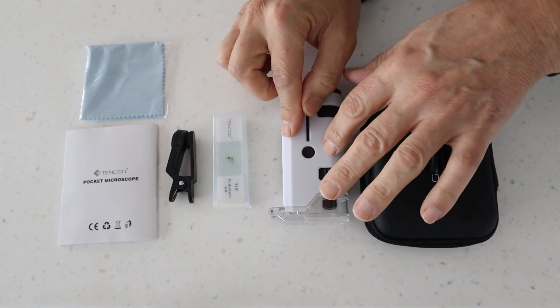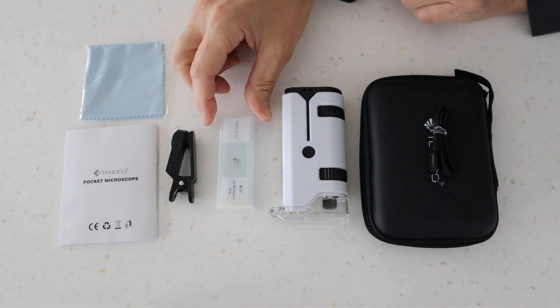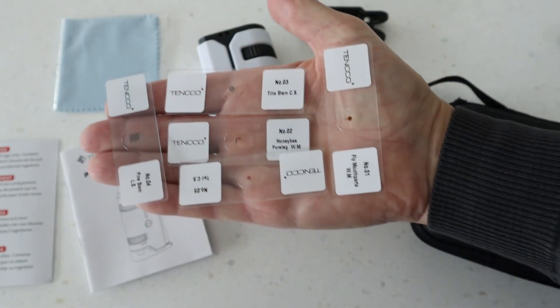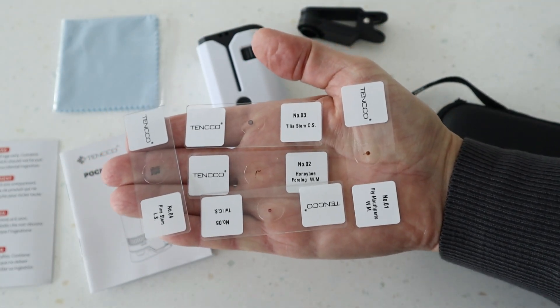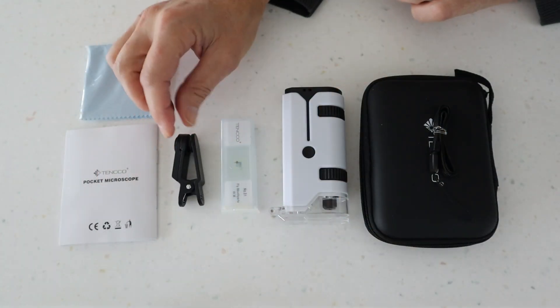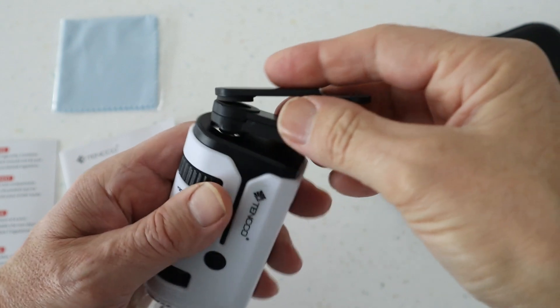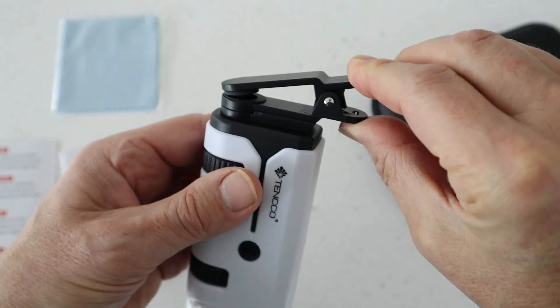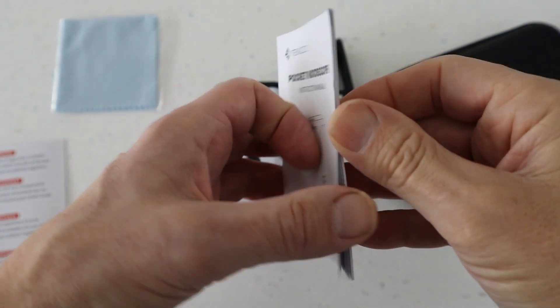You're naturally going to get the microscope itself, and I'll tell you a bit more about that in a moment. You get five slides provided, which is fantastic, so you can start observing with the microscope as soon as it arrives — five different samples for you to take a look at. You also have this clip here which allows you to clip your phone to the microscope, a really great feature because it lets you share and keep photos of what you're seeing. There's a little user guide that explains how to use it, but it is super simple.